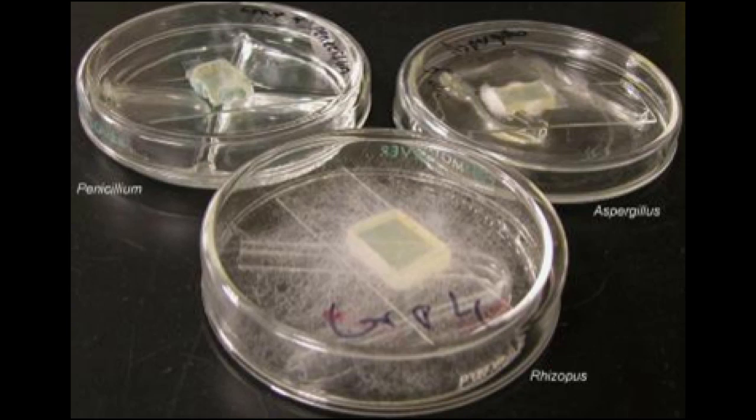This can be achieved by tease mount, a technique in which a part of the growth is teased with needles, a drop of LPCB is added, covered with a cover slip, and then observed under the microscope. Although it is the most common technique used in mycology, identification is often difficult by the tease mount method because of the dislodgement of conidia and spores from the conidiogenous cell.